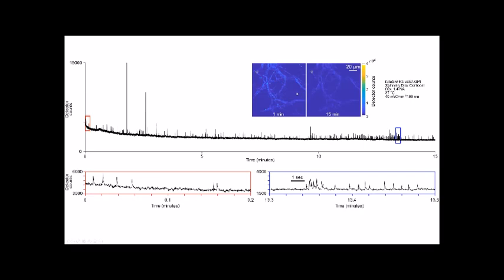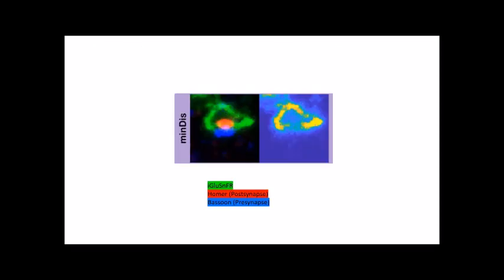There's a piezo focus lock on this microscope, but then we still see this heterogeneity of spatial extents of events. And of course, we're very interested in the spatial extent of events because that's what led us into this work in the first place. But in culture, we haven't developed methods that are appropriate for looking at that. Thank you.